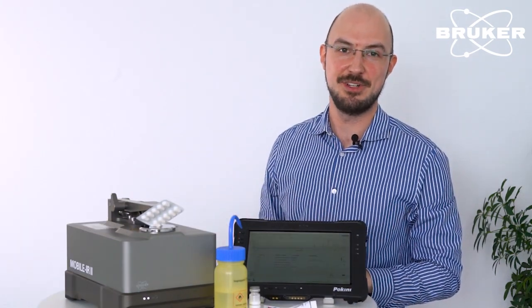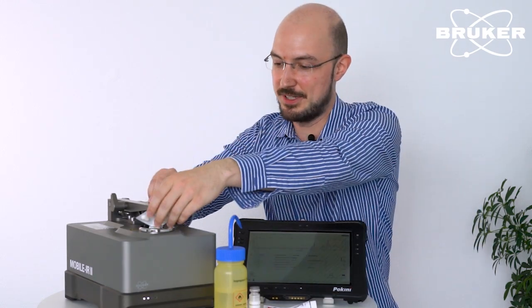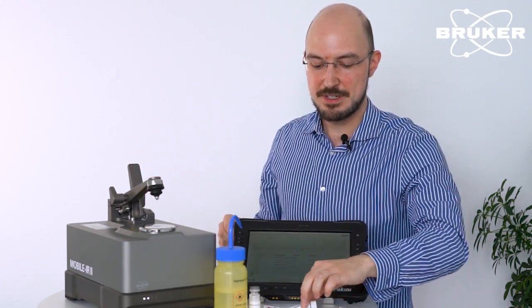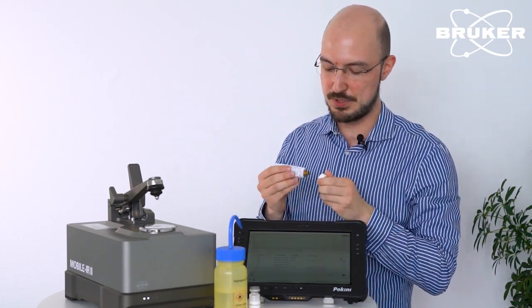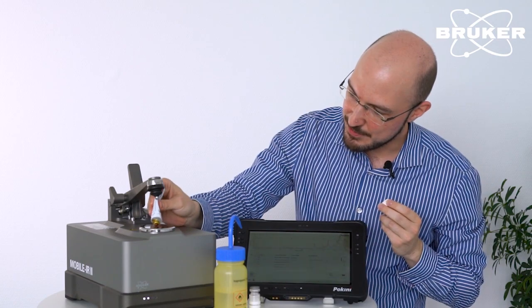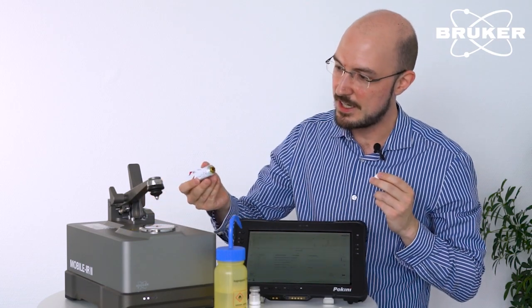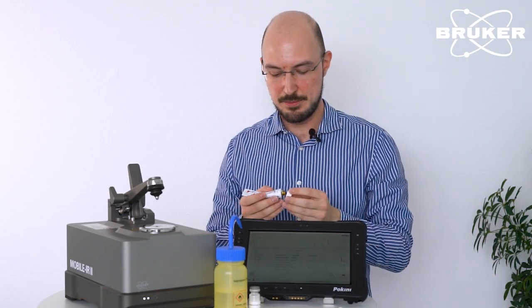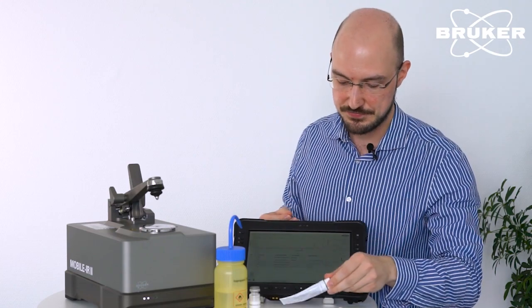But in the pharma industry, there are other materials which need quality control, not only packaging material. For example, some pastes. So we can now put some of this paste on the ATR crystal and don't need to apply pressure because there's good contact between the diamond crystal and the paste.